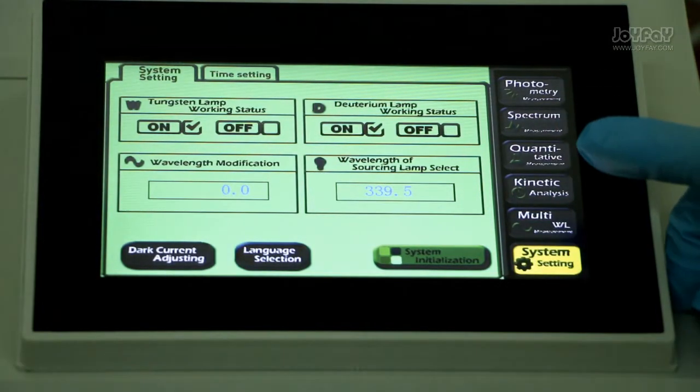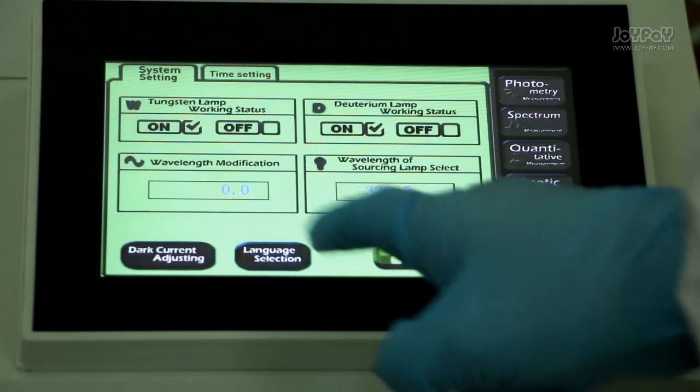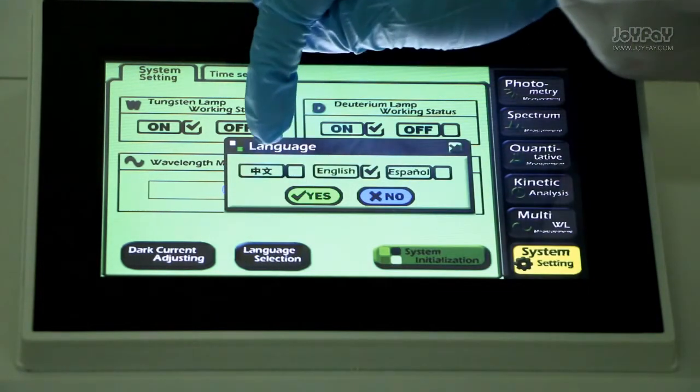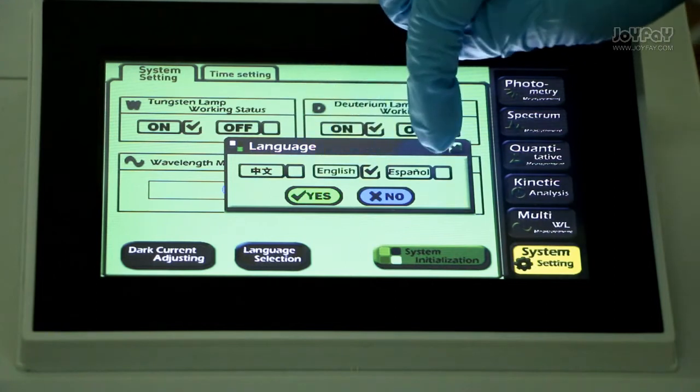Testing lamp language selection. By pressing this button, you can set the language you need. We provide Chinese, English, and Spanish.